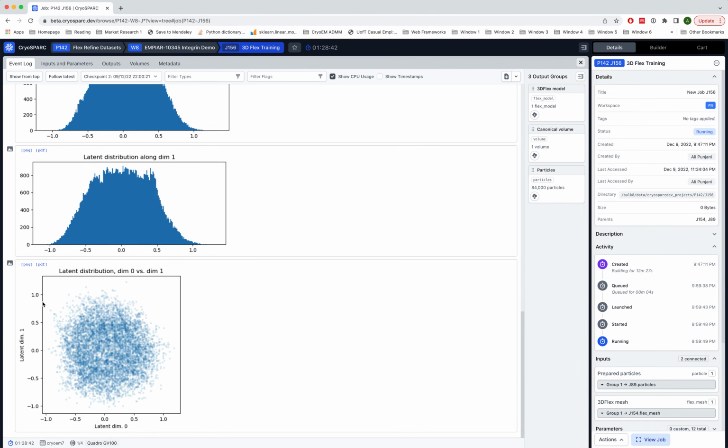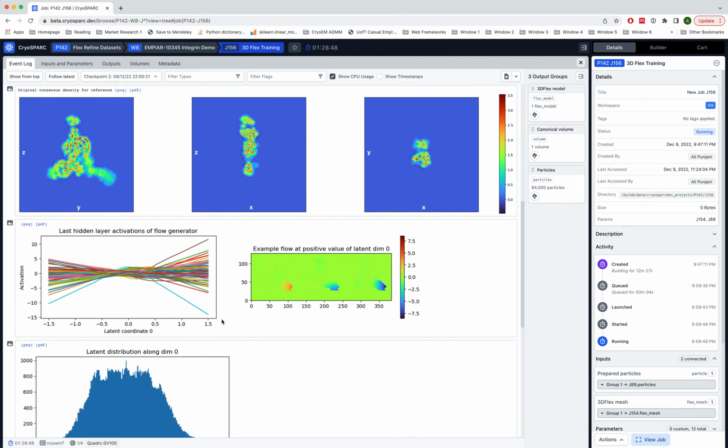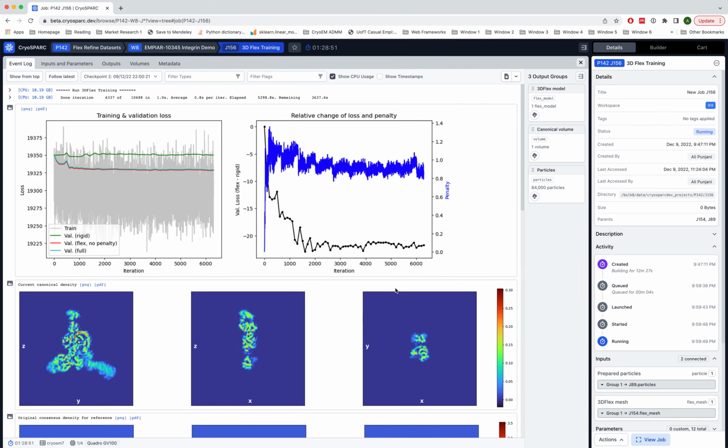So as long as we're not hitting the edges of the range or being too closely packed around 0, everything is good in this latent space. So these are all the training time plots that help us understand what's going on during training. And essentially, while this training is happening, we can either watch these plots or just take a break and come back, or we can start using some of the visualization tools that allow us to look at what the model is learning while it's still training.